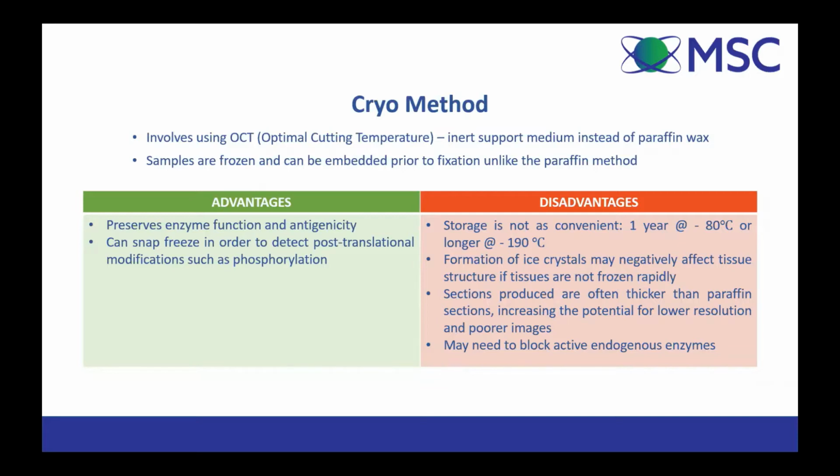So it really does depend on what you're looking for. And considering the fact that it preserves your enzyme functionality, you may actually need to block active endogenous enzymes to stop them from degrading your samples.